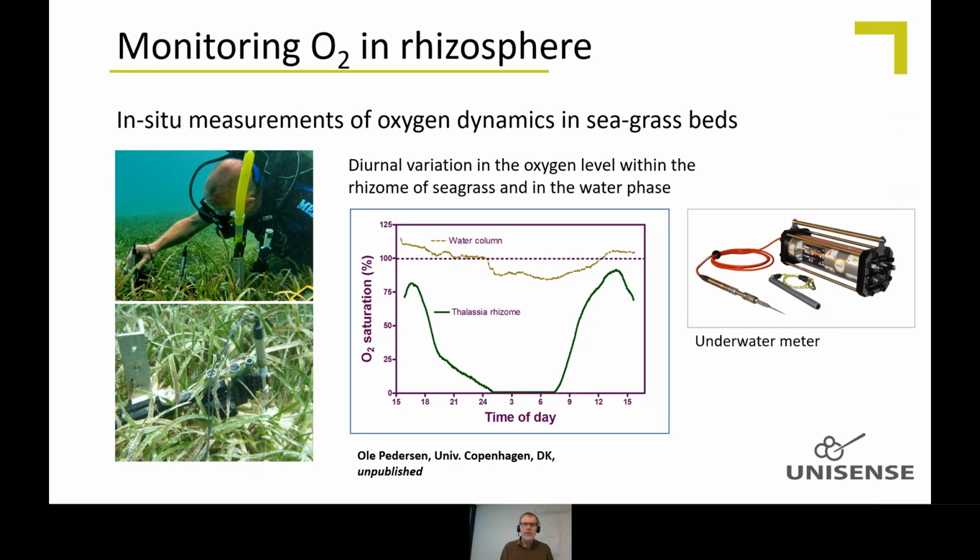And he uses the underwater meter for this. This is a diver operated meter, waterproof to 30 meters. Sensors are mounted via the in situ amplifier, and the meter here is operated using this stick that has a magnet on the end, so you can just touch the different parts of the instrument and operate it there, start logging and stop logging and so on.